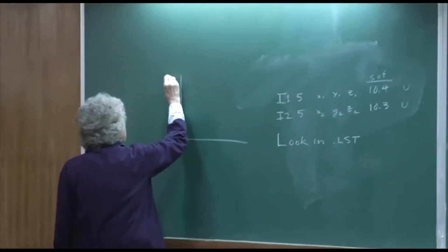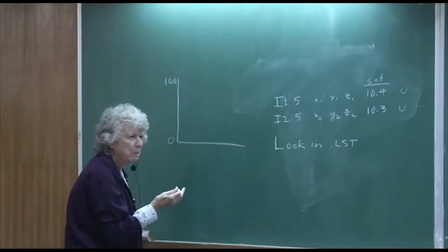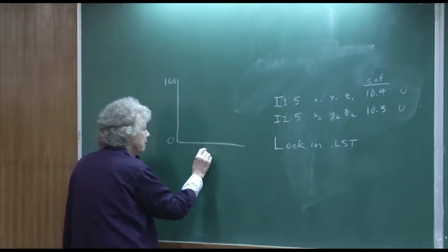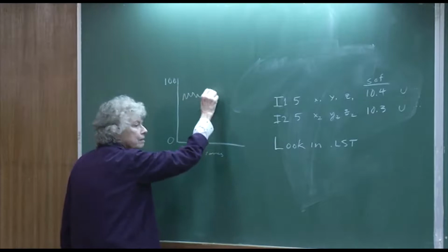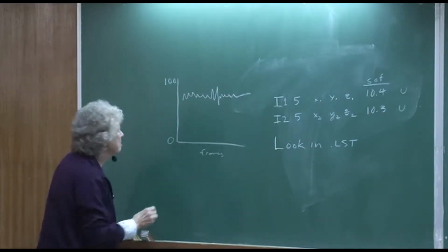It goes from something like 0 to 100, I think, or either 100 or 1, I can't remember. And then as you go over your frames, or your images, whatever you call them, it's going kind of like this. I'll keep an eye on that.